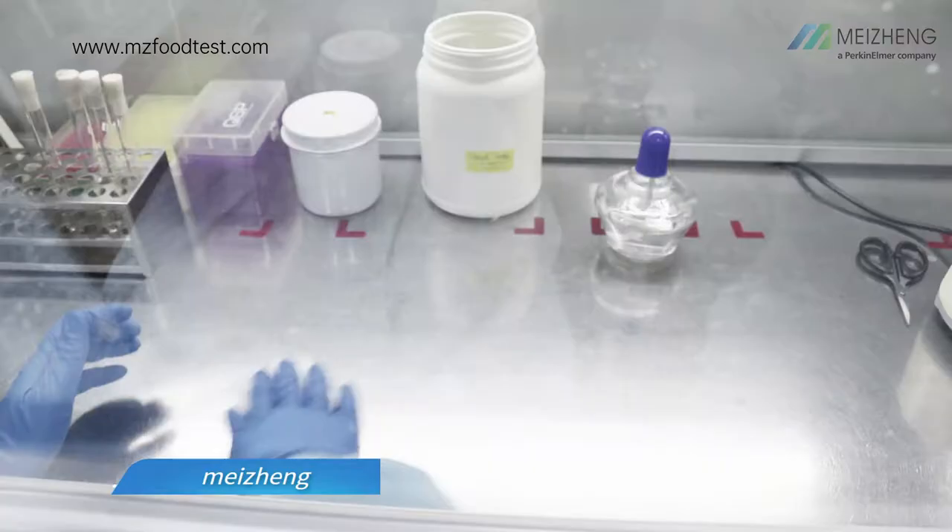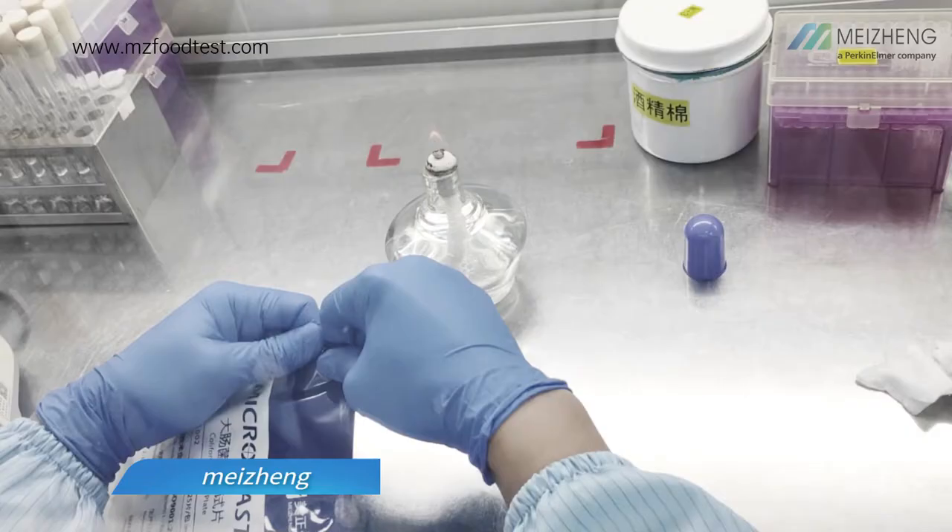Operation video of Coliform Plate. Wear lab coat, mask, and gloves. Wipe gloves and operation table with alcohol cotton ball. Light the alcohol burner. Wipe the packaging.